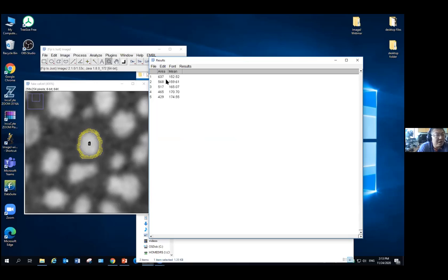So if your goal in your research, your project, is to compare the size change under two conditions, your control condition and your experimental condition, then which threshold to choose will be totally decided by the thresholding you choose.